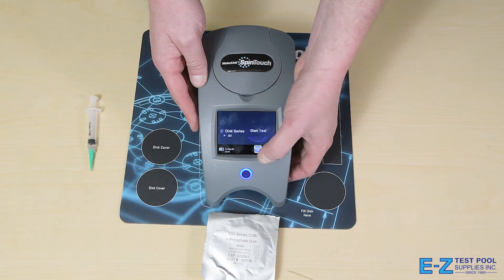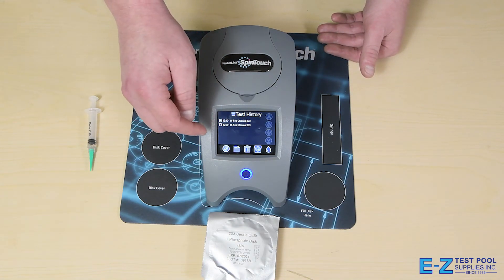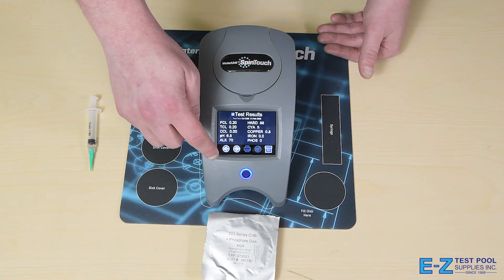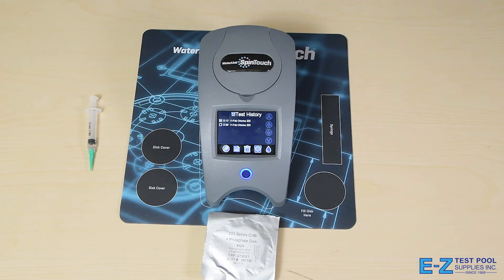Once the results are read, they're able to be stored in the unit itself and also in the cloud. You're able to do unlimited tests and go back as far as you need to. To look at any of the tests in the past, you're able to go into the menu and look at the test history. Here we have the test I just did as well as what I did a little bit earlier. You're able to check on the units, view the results, and cycle through all the tests you've created. This is fantastic as you're able to have a full history of the work you've done and the chemicals you've used on the pool.